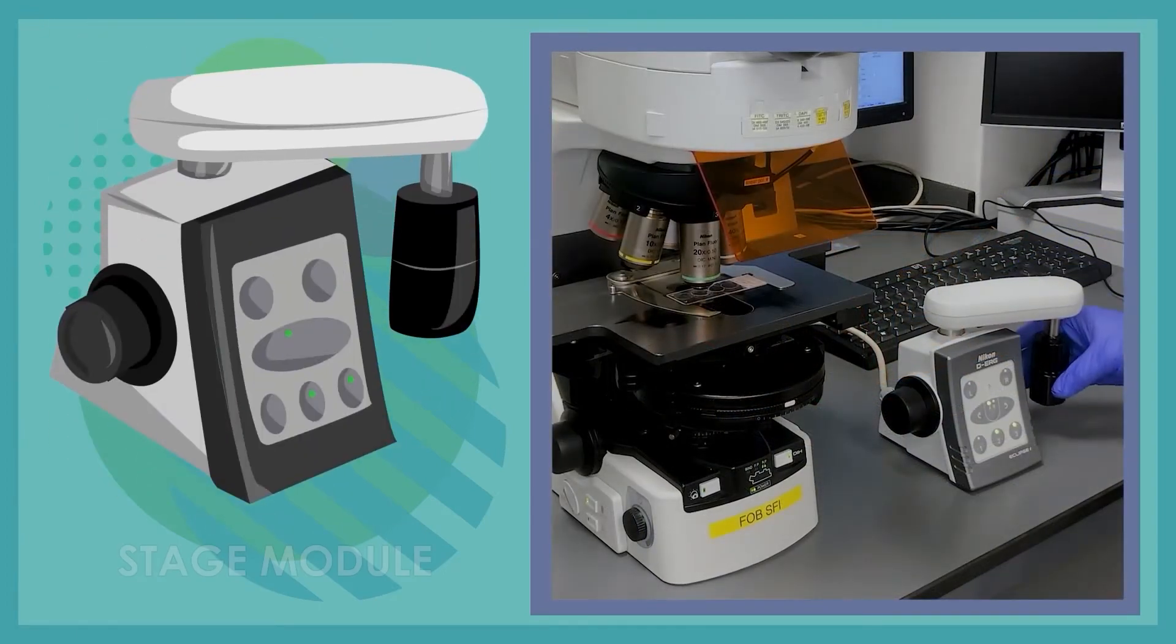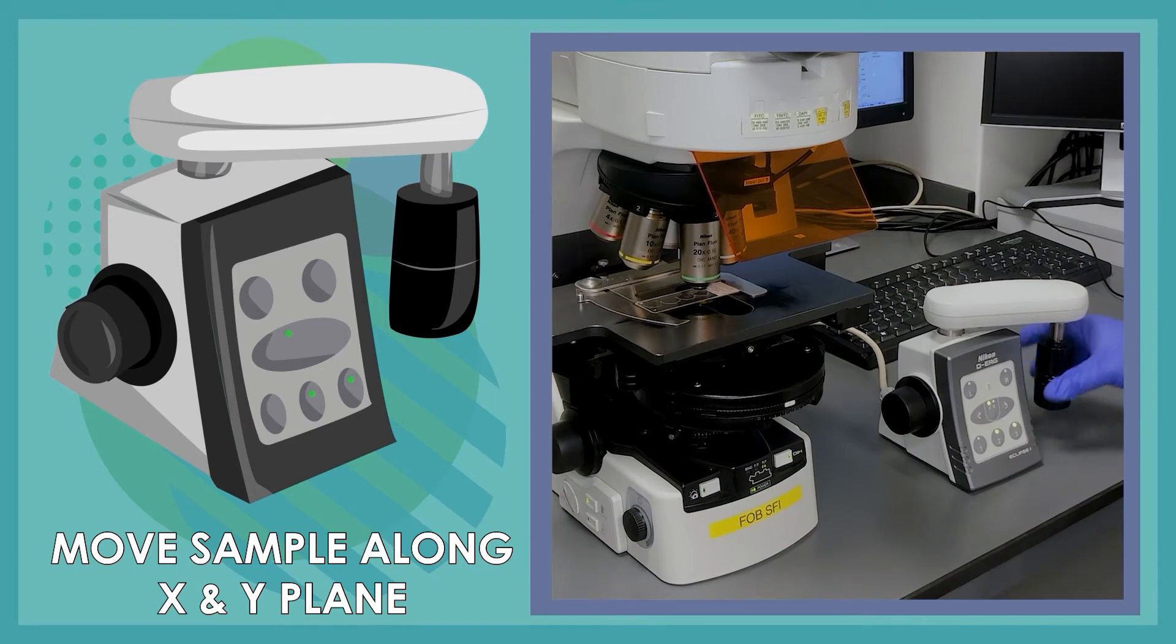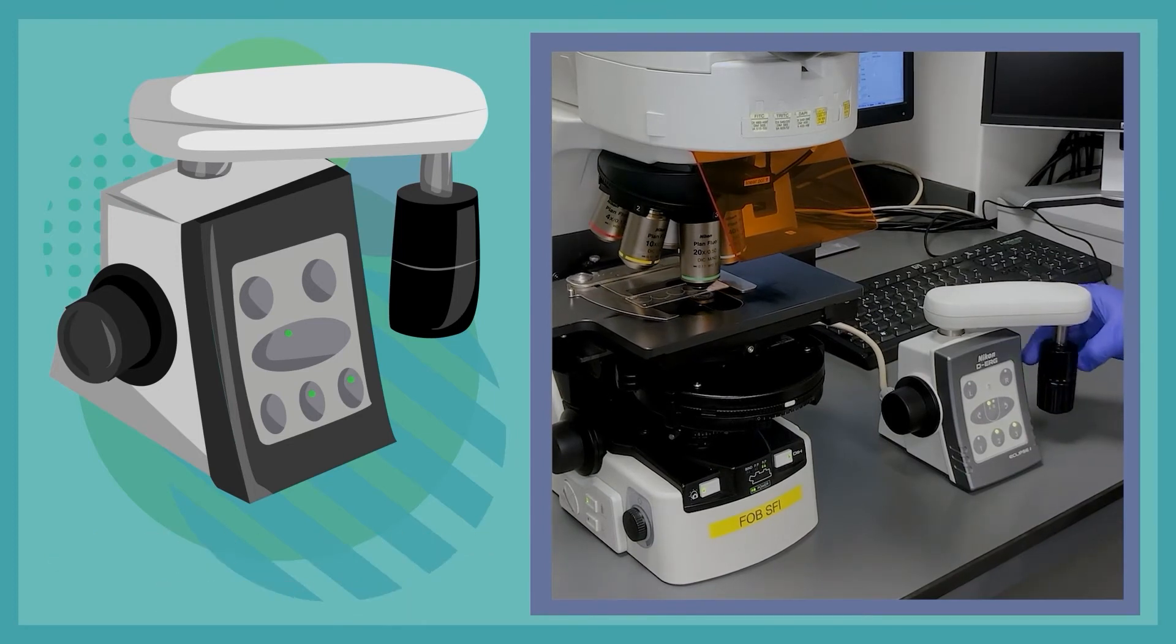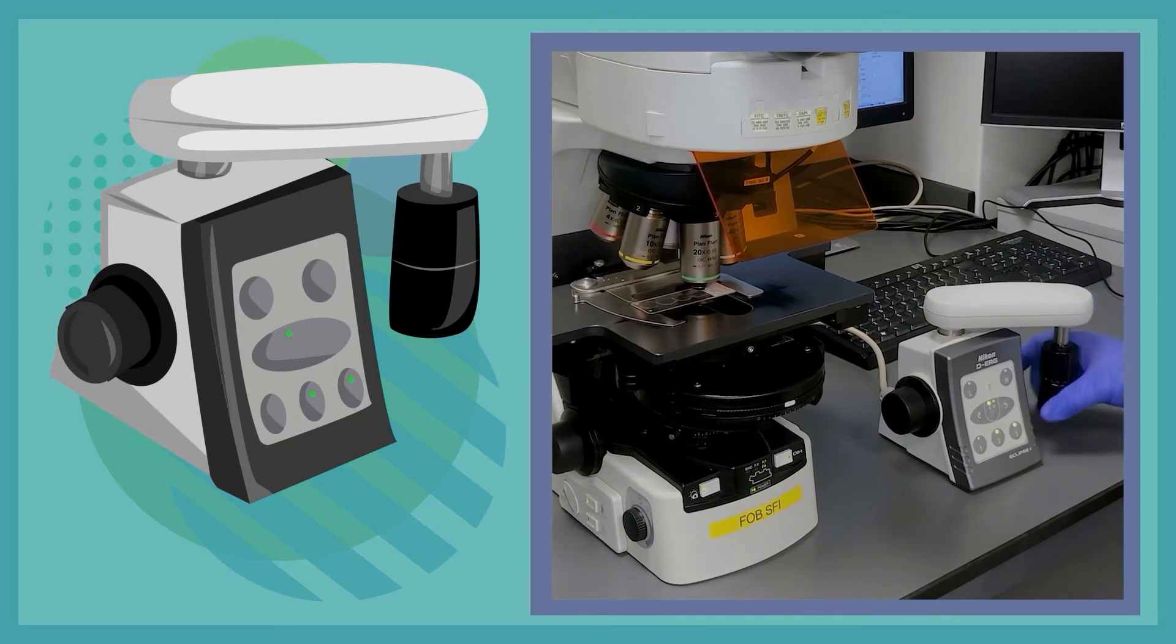This is also the stage module that allows us to move our sample in an x and y plane under the objective lens pieces. This allows us to look at different regions of interest of our sample under the microscope.